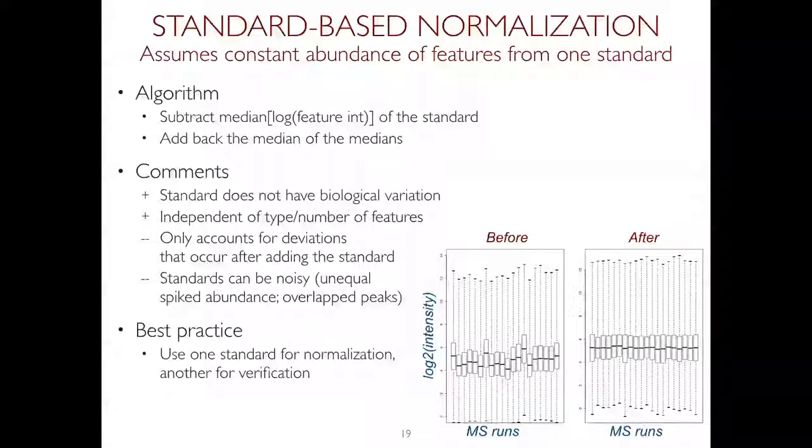What Brendan is also suggesting is to have technical replicates and then use the CV of the technical replicates, because then you don't use biological information. But this means that you will have technical replicate DIA runs, which also may cost extra money. So these are trade-offs, but I think the bigger point here is that the more prior information you use, the better your statistics becomes. It's a fact of life in general statistics, right? The more prior information you use, the better you do.